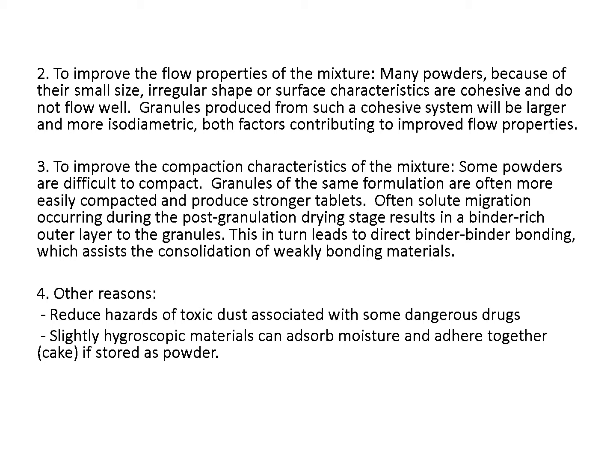So by enlarging the granules, we get fewer contact points, resemble a sphere, and enhance flowability. With higher and constant flowability, the rate at which the tablet die is filled is nearly the same, so it will enhance content uniformity.